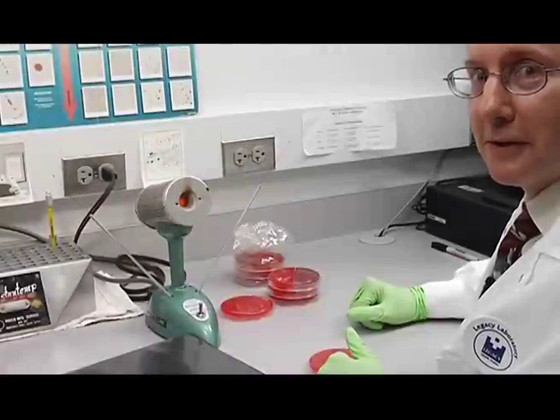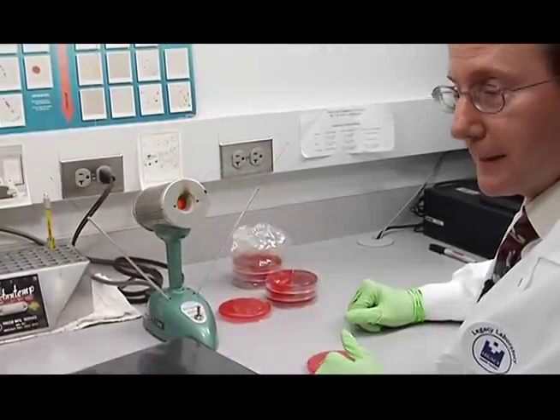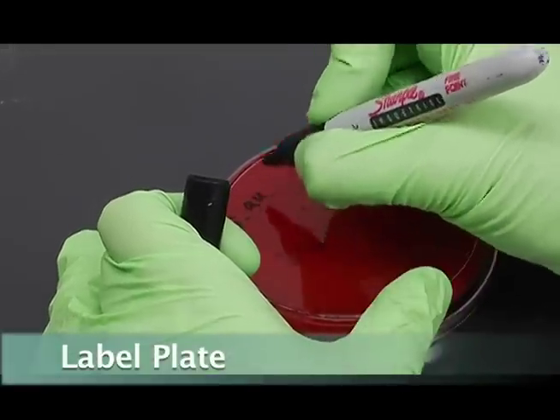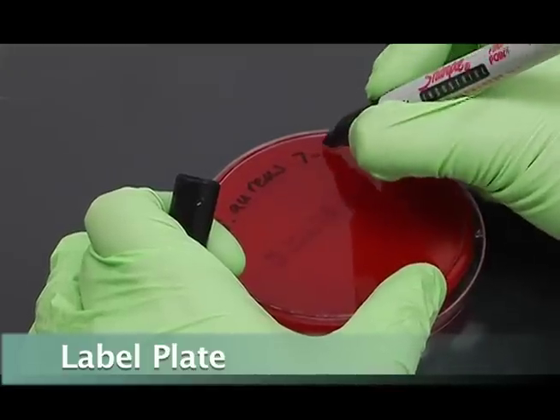The second reference culture that we will subculture now is Staphylococcus aureus. First, label your plate and today's date.